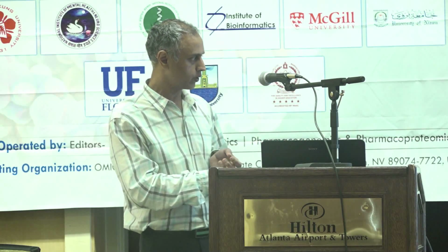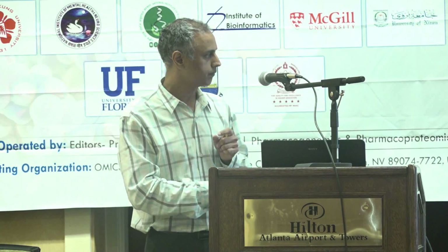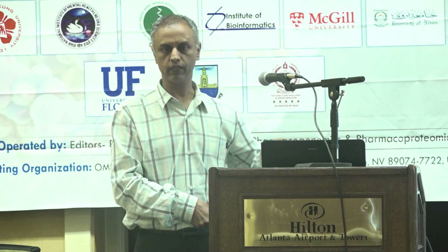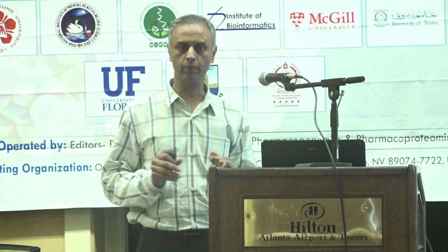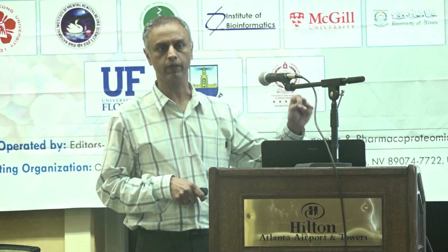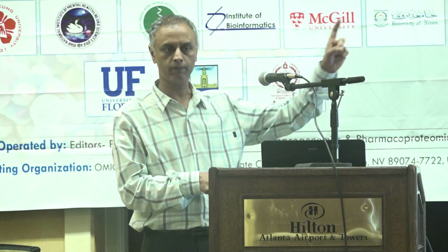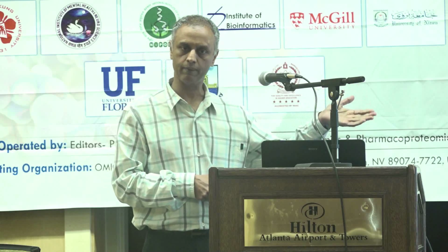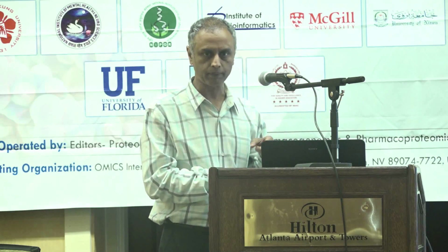Here what we did was, we took some of these sputum samples with presumed TB, and we can identify all of these proteins that are unique to Mycobacterium tuberculosis. There are many atypical mycobacteria, but these peptides come from pathogenic Mycobacterium tuberculosis. So proteomics can take you directly from sputum into a diagnosis of MTB. You don't need a microscope. You are getting the sequence of these peptides that tells you.